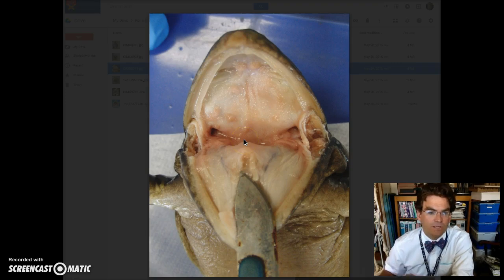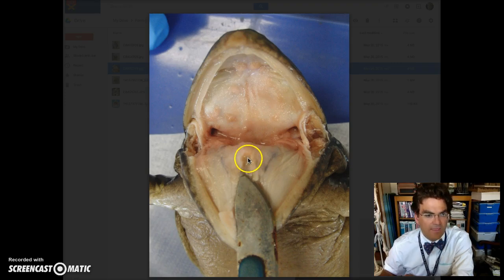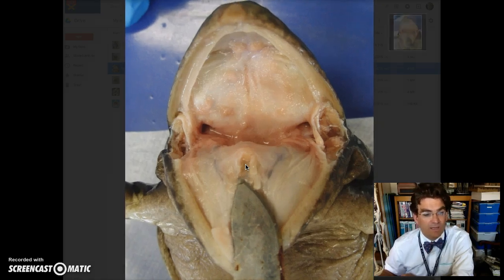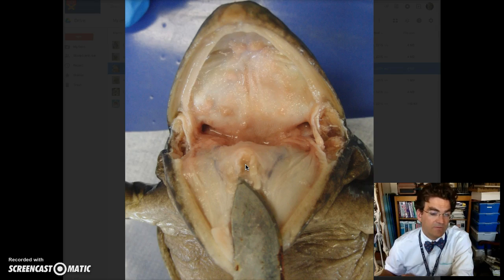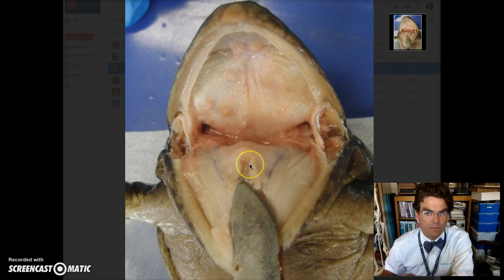The next is the glottis, and the glottis is kind of hard to see — it's this thin area right here, and it leads down to the lungs. A lot of you, for your lab, put the eyedropper into that portion of the frog to help inflate his lungs, so that leads down to the lungs. This is the area for the glottis.